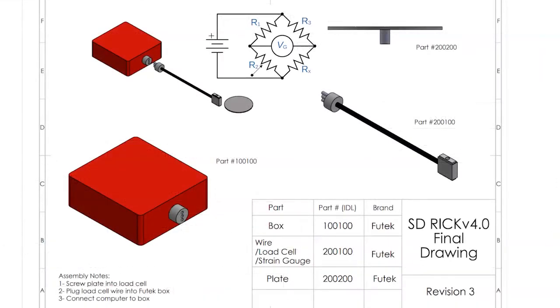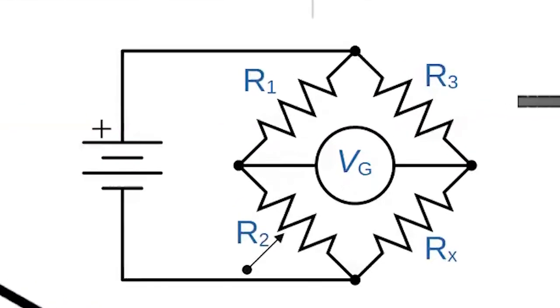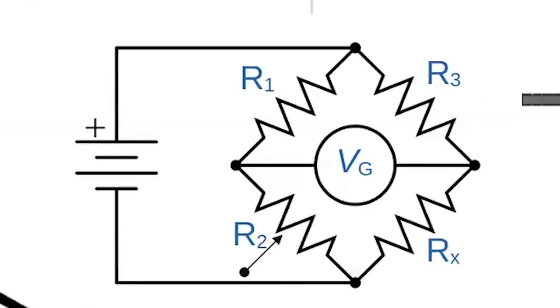The second half of our system, the load cell sensor, allows us to approximate the volume of liquid on top of our stained slide. The way this works is through a Wheatstone bridge. A Wheatstone bridge essentially consists of 4 resistors. 2 are in series, but in parallel with the other 2. And between these 2 parallel sets, a voltage difference is measured.